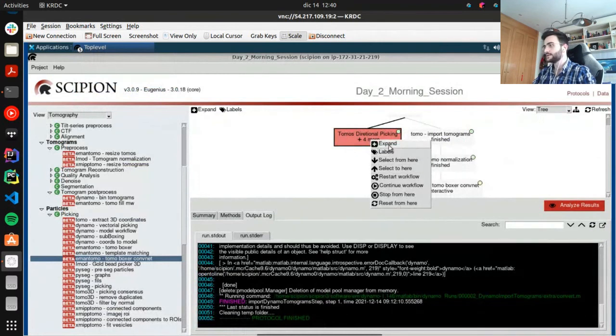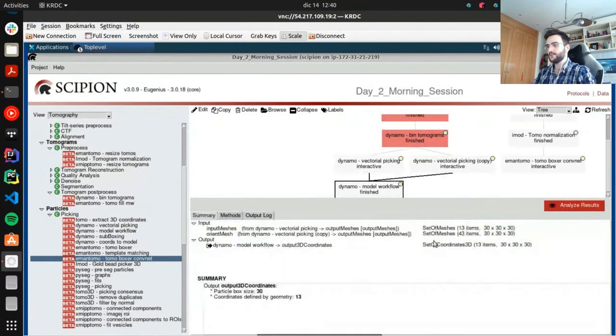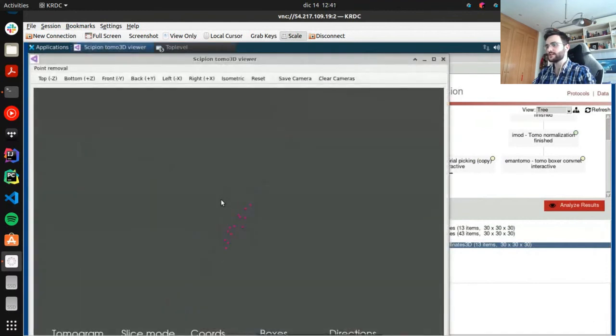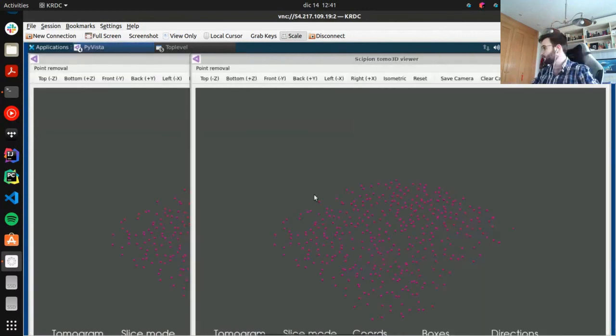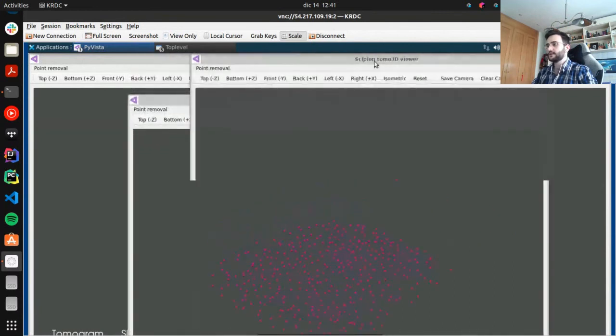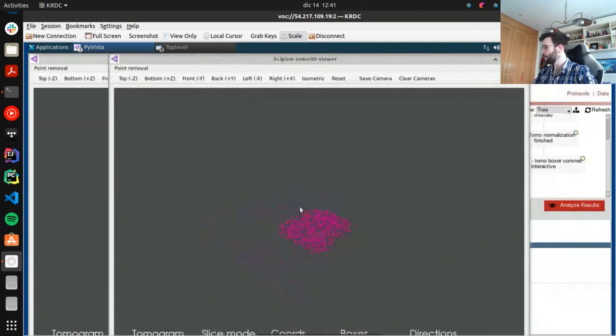It should open. So I'm going to do it with this one, for example. Yeah, this one's open. So there has to be a problem with the paths in the sample project. We will have a look at that. So if you want to check the results there, you can see why this is happening. But you should see your particles. In your case, you should see many particles because you're picking. Oh, it was taking a long time. Great. Okay, so I have opened it three times. So we can go with the one of Eman. Sorry for that. I didn't know it was taking that long.